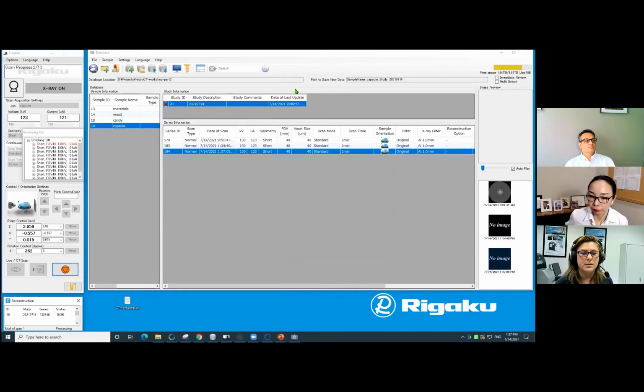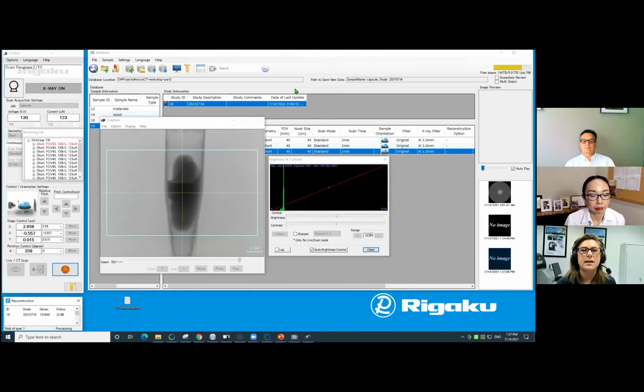So for these quick scans, we're not doing it. These are the types of scans that you would do to evaluate your initial conditions. And we're using quick scans so that we can look at more than just one sample for a workshop. For longer data collections, in fact, you're going to use what's called a step scan. And in that case, every incremental rotation step, it's going to move the sample, and then that gets rid of those artifacts. So you don't see them for the longer scans.